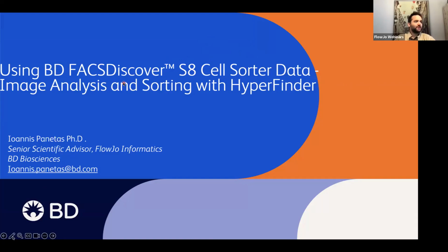So today in this webinar we will be focusing on analyzing data coming from the S8 FACSDiscover with FlowJo and its plugins. This applies, and will also be applied, to data coming from the A8 or any CellView technology from BD.